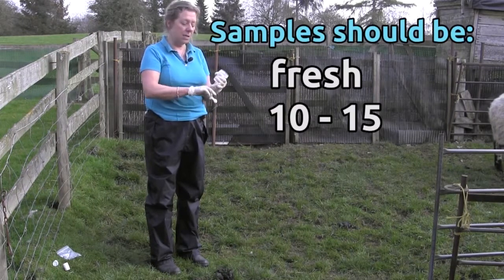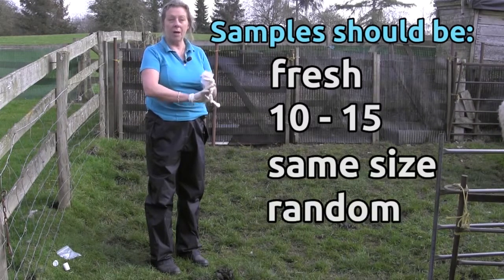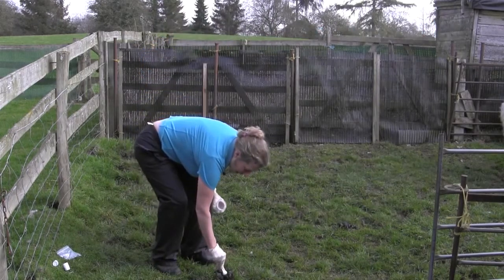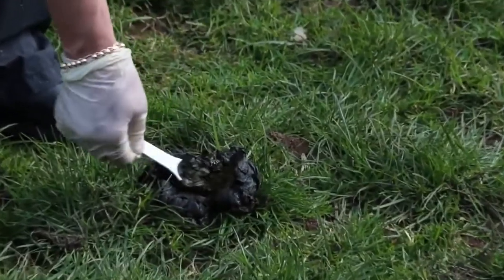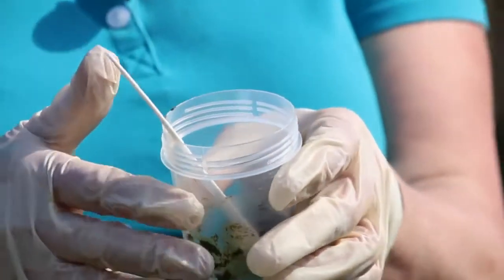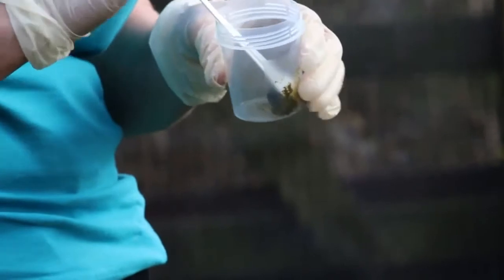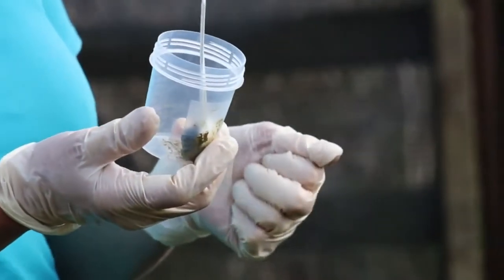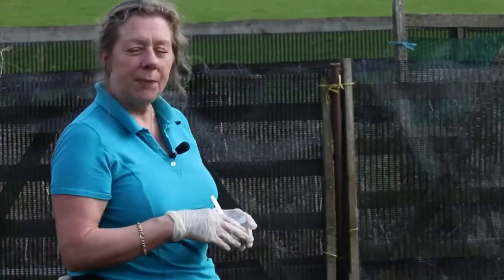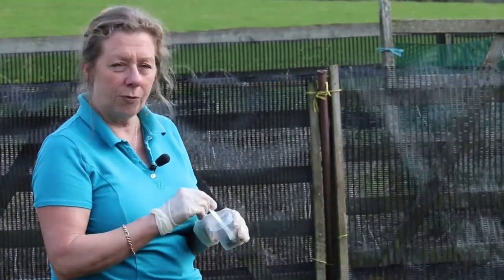So: fresh, 10 to 15, the same size, and completely at random — and then you're going to get a pretty good indication of what's going on in that group. From a point of view of sample size, we use these little spoons; from each sheep a small amount like that is fine, so long as you take that same amount from each sheep and put it all in the pot. The lab will mix it up, homogenise it, and take a representative sample from there.